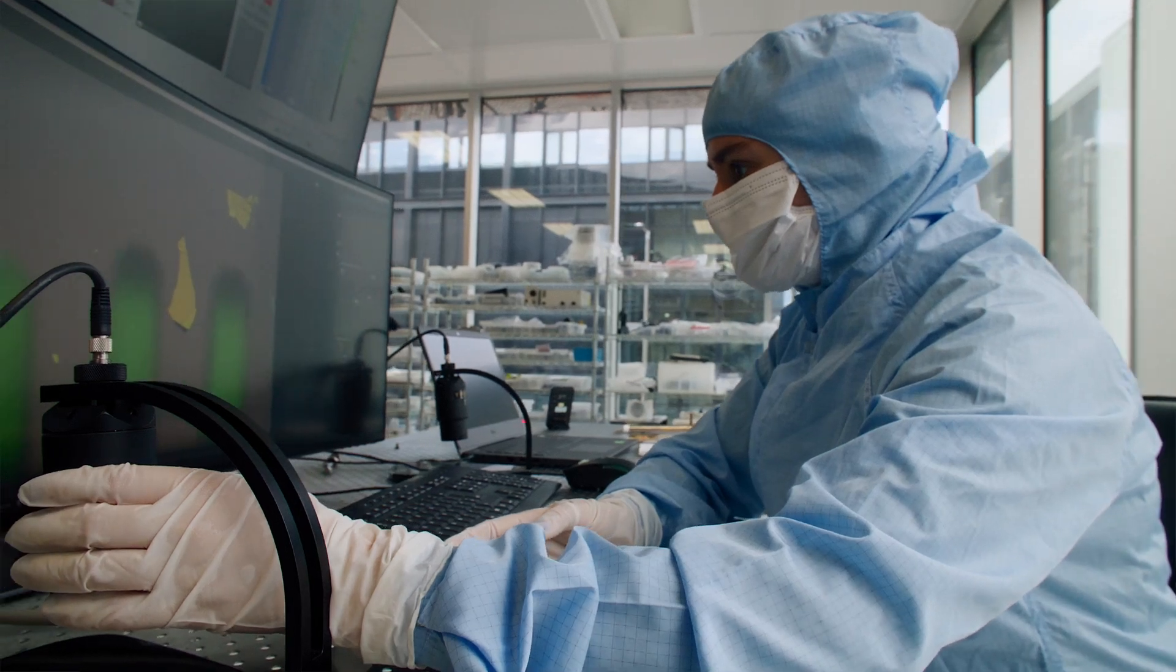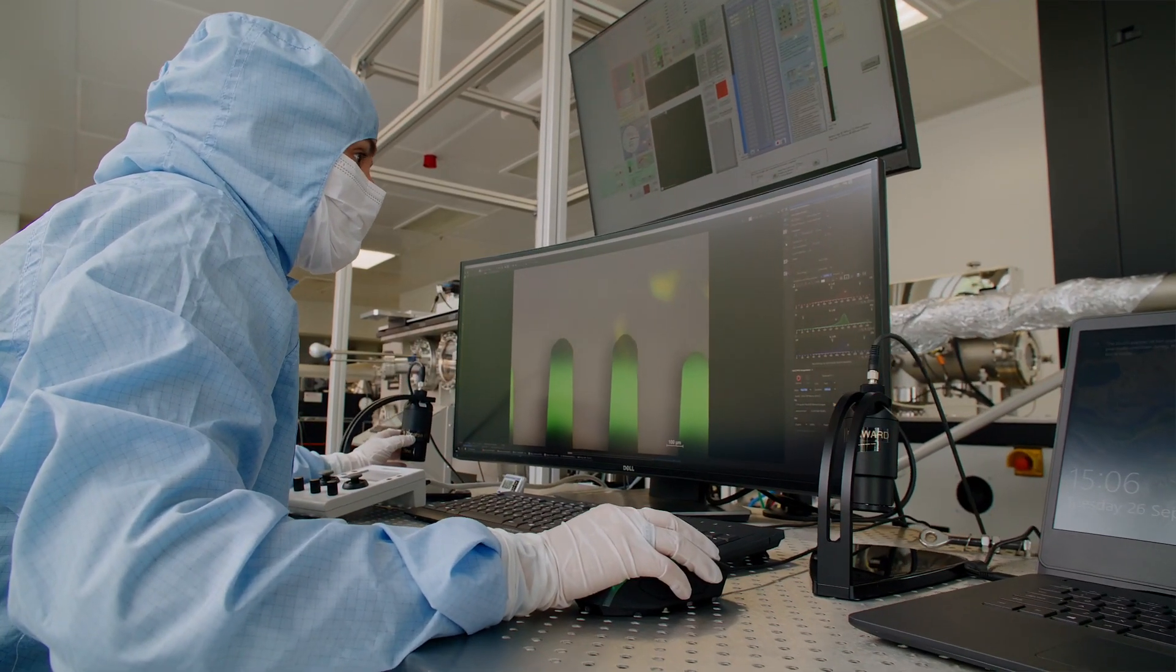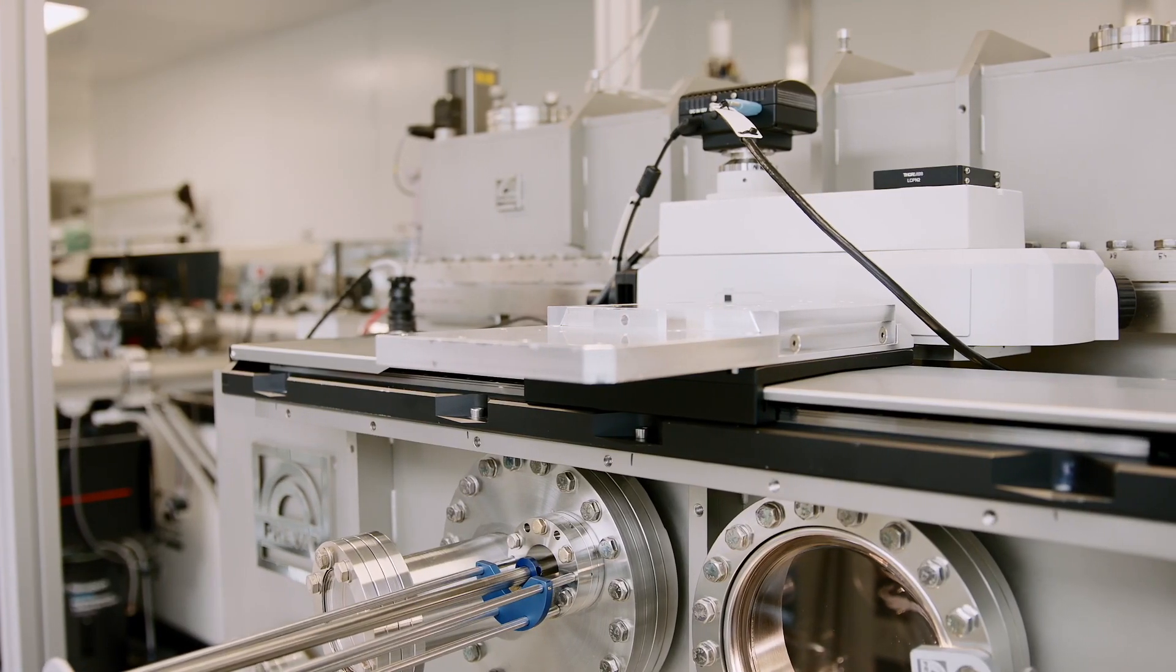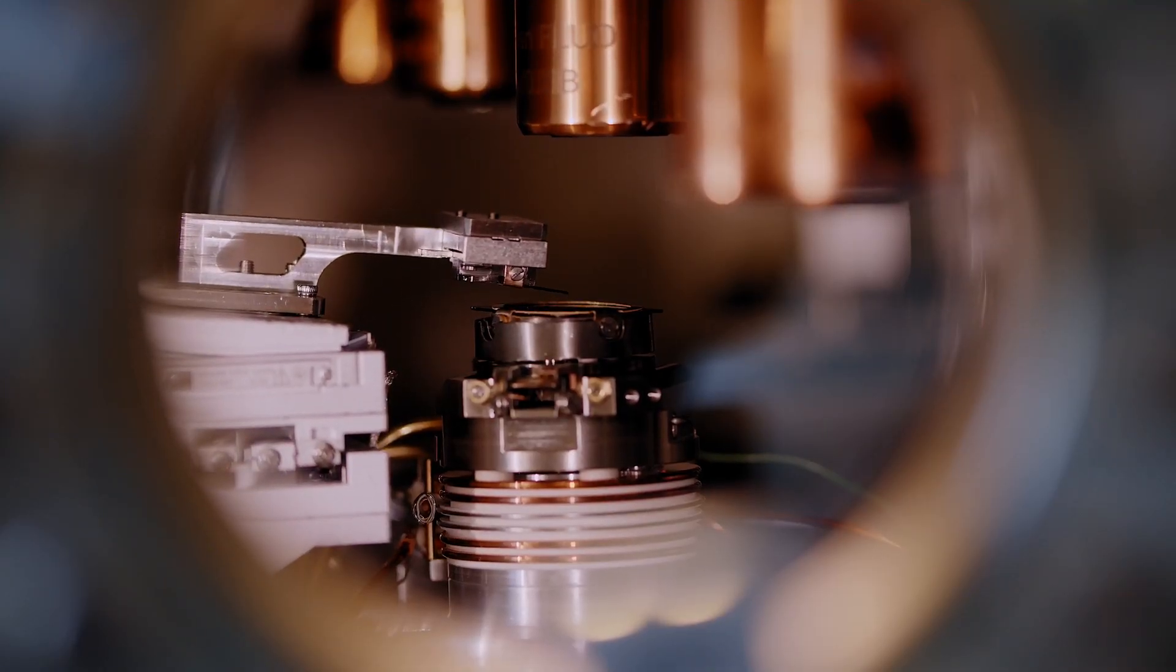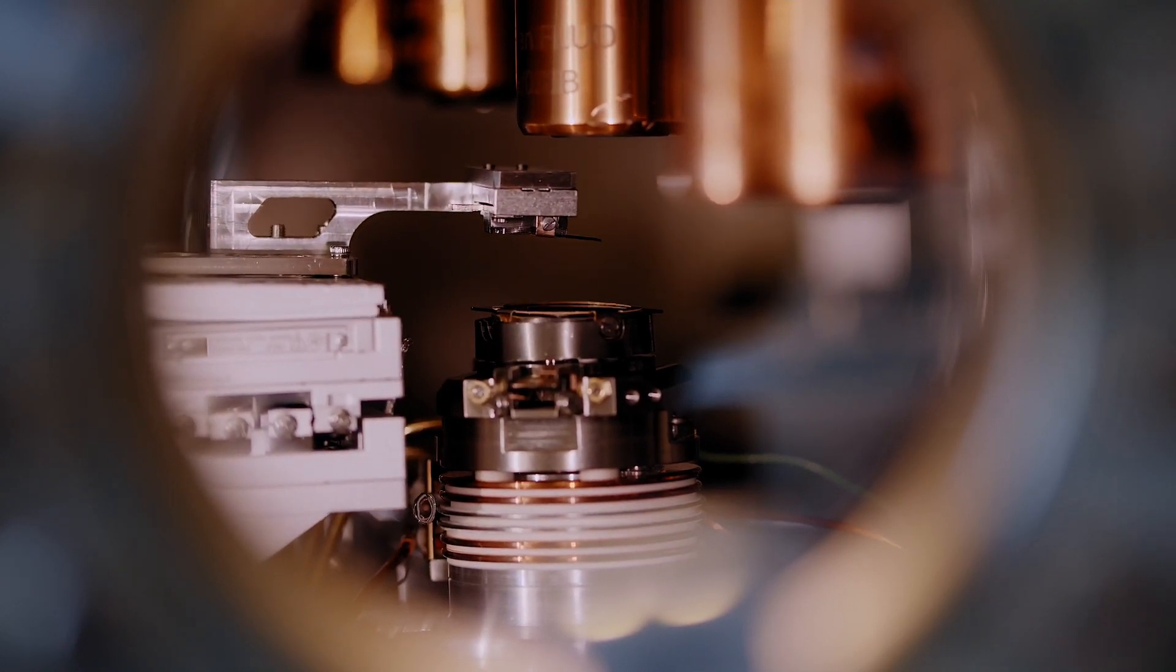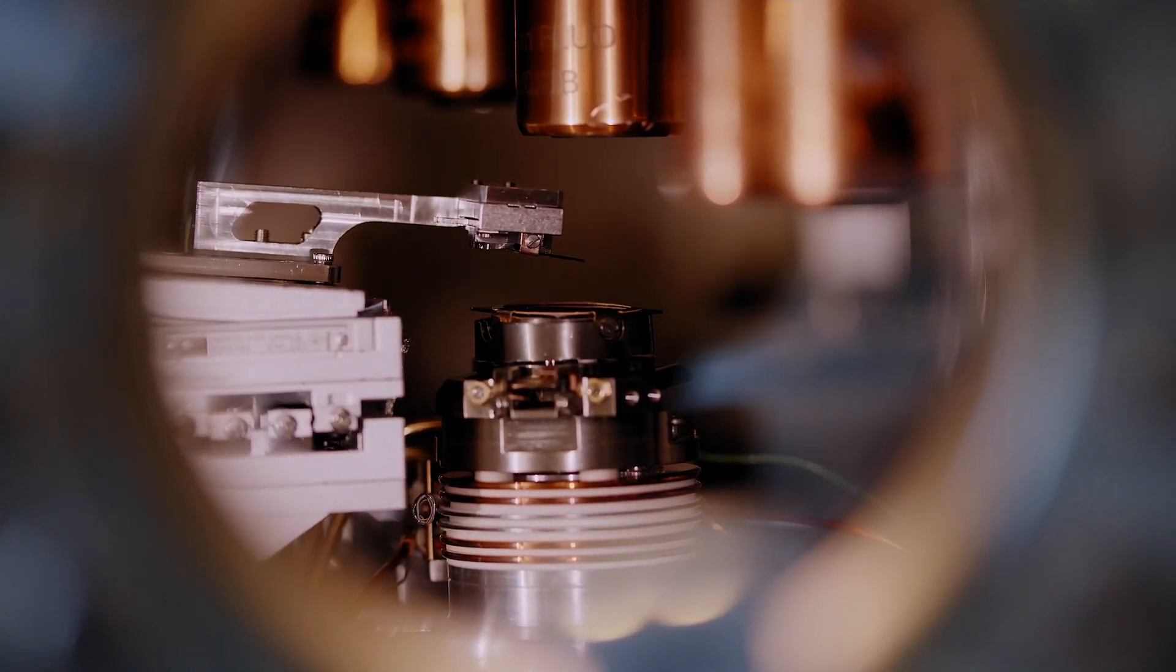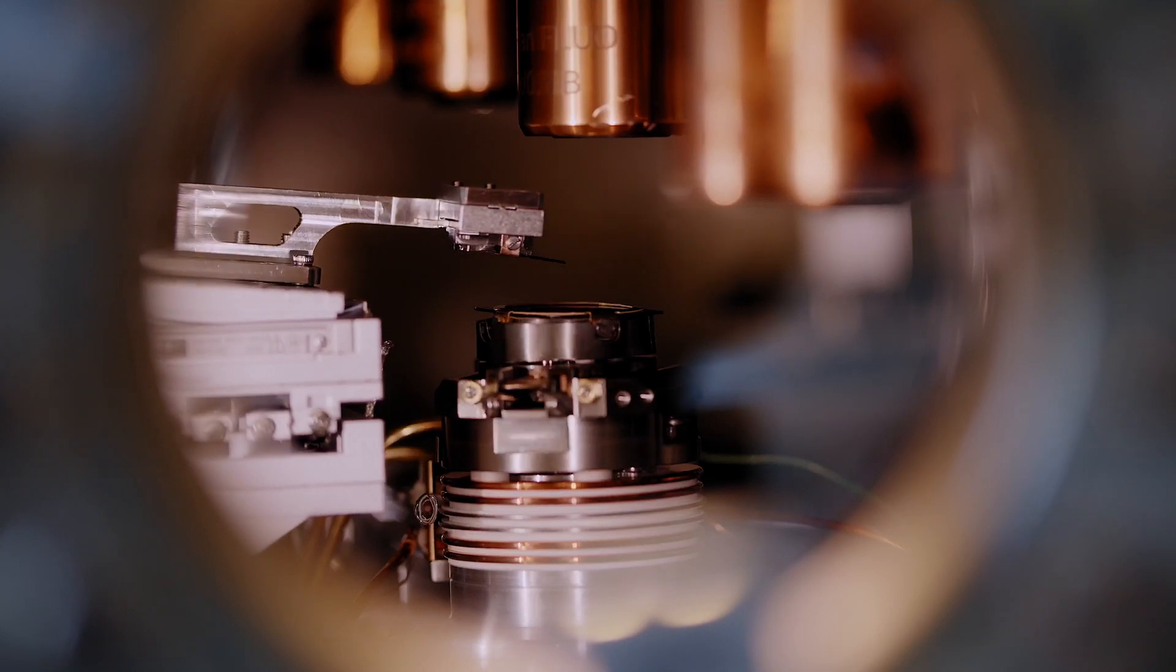We can use the optical microscope setups we have in the core chamber to easily search through all these exfoliations to find the crystals with the exact dimensions and thicknesses we need. We have two stages that can all move in X, Y and Z, they can rotate and tilt. This means we can position our crystals with up to nanometre precision.